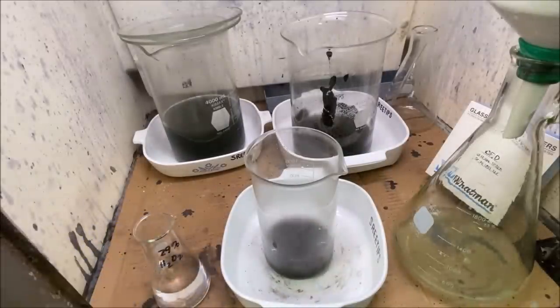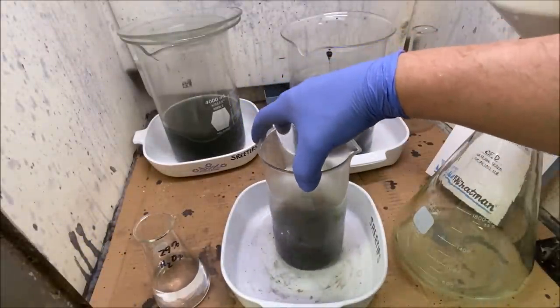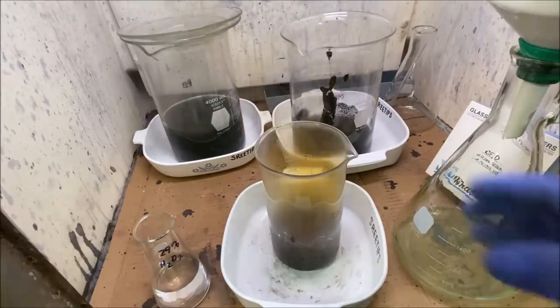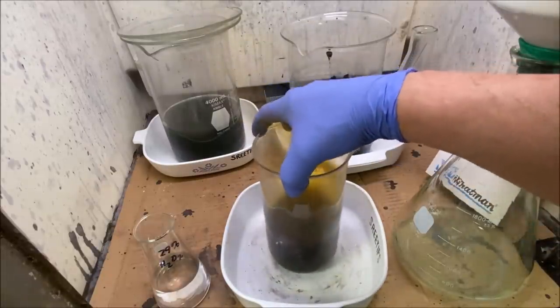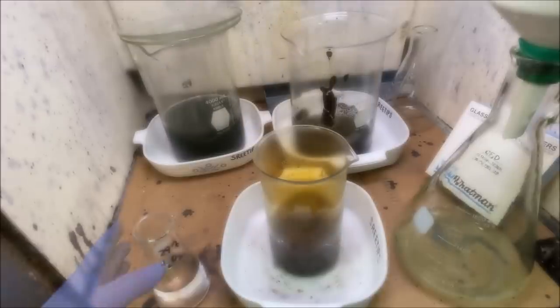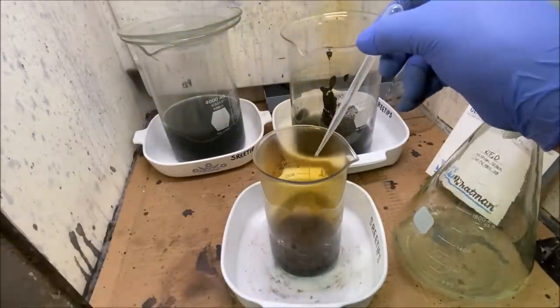Alright, now we're going to start forming our piranha solution in here. Look at that. We got some fumage going on. That's probably because we got a whole bunch of nitric in there still. I'm gonna go ahead and start adding some of the 29% hydrogen peroxide.